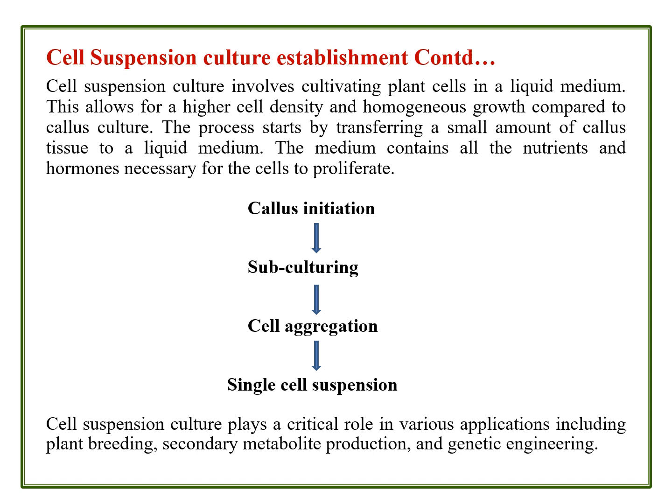Here all the cell aggregates are disintegrated because they are maintained in a fermenter-like apparatus or a bioreactor, where a baffle or a sparger always circulates or mixes the culture medium as well as the cell aggregates, so that each and every cell aggregate gets the same amount of nutrients, and the aggregates will increase more when compared to callus cultures.